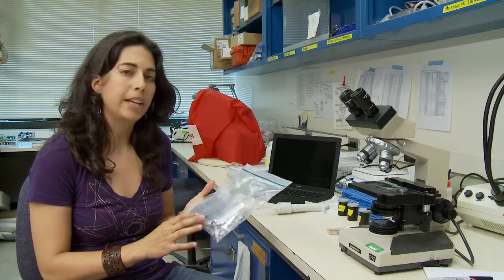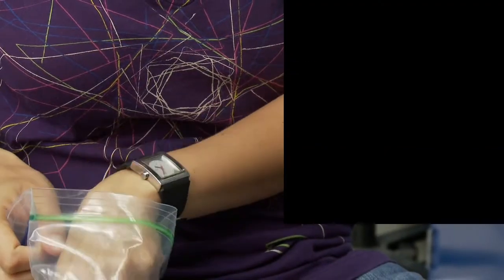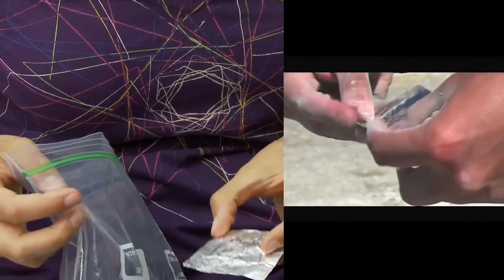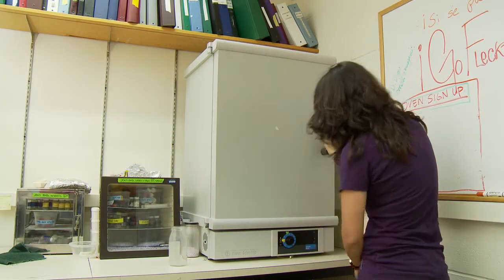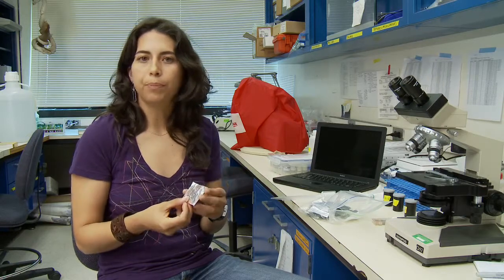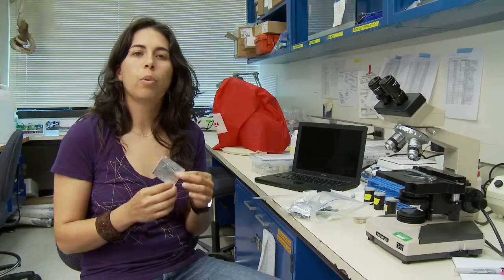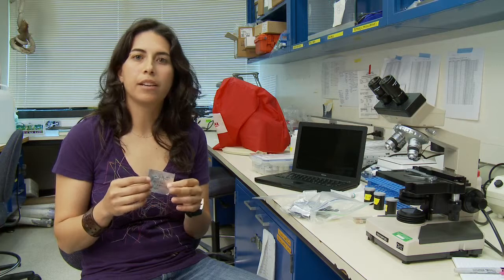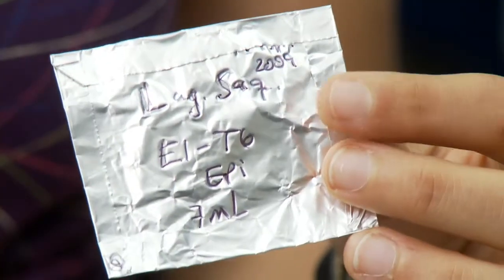Once we've done our chlorophyll analysis, the next thing we want to do is an analysis for organic matter. The process here is pretty simple. We've got our sample in an envelope, and again it was collected on a filter. This filter is kind of wet, so the first thing we need to do is dry it out. We dry it out for 24 hours in what's called a drying oven. Then we weigh that dry sample. We take that to a balance to get a really precise reading of the weight of that sample. When we get a final number that gives us how much organic matter was burnt off of the sample, that tells me how much organic matter was on this filter when we took the sample.